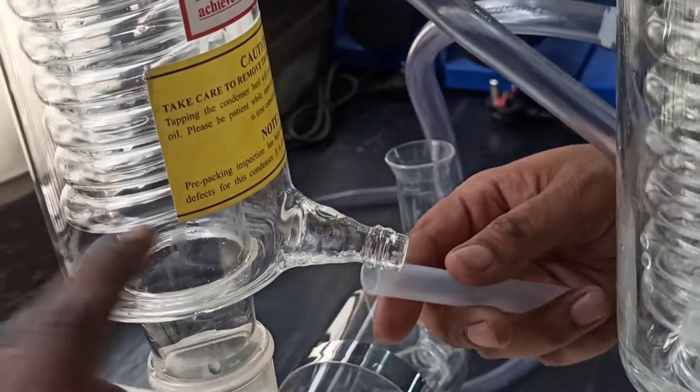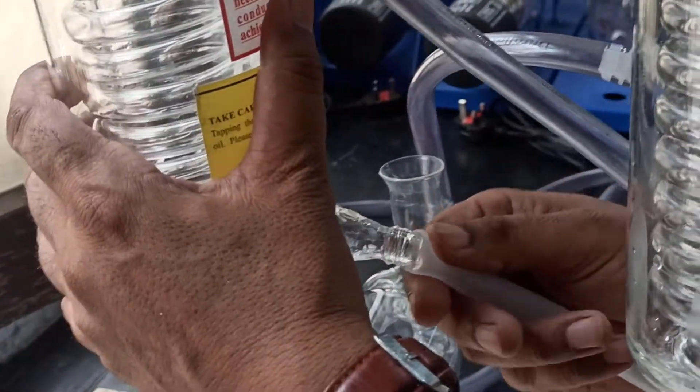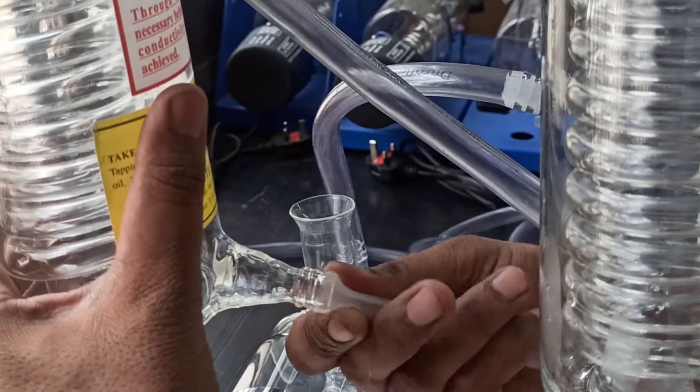Connect the distilled water output of the first stage with the input of the second stage boiler with silicon pipe.